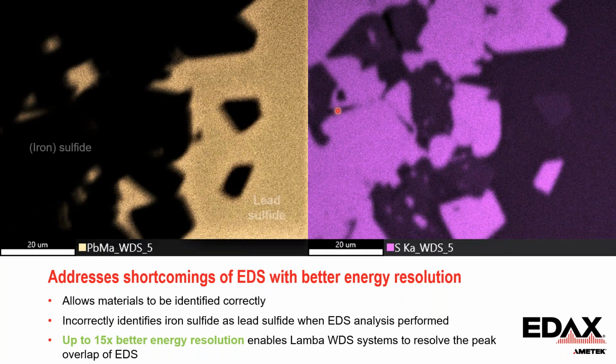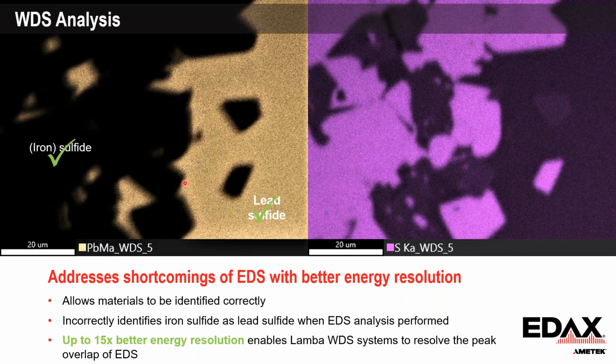So in the WDS map of lead M, we see lead sulfide is only on the right-hand side. On the left-hand side, this is actually iron sulfide. So the WDS map resolves the peak overlap and gives us the correct information of the phase distributions.